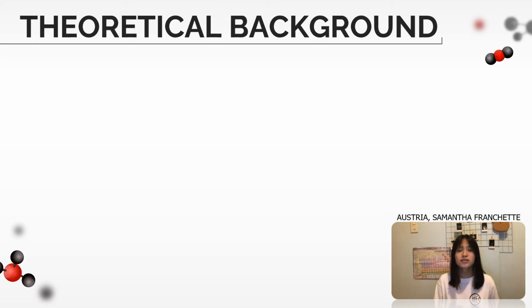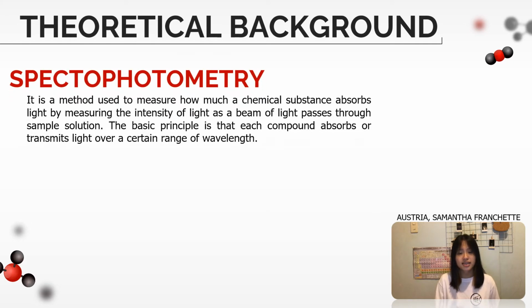So, what is spectrophotometry all about? Spectrophotometry is the quantitative analysis of the interaction of ultraviolet, visible, and infrared radiation with a substance as a function of wavelength. The nature of this interaction deals with the physical properties of a material, such as its opacity, thickness, roughness, smoothness, and even pureness.